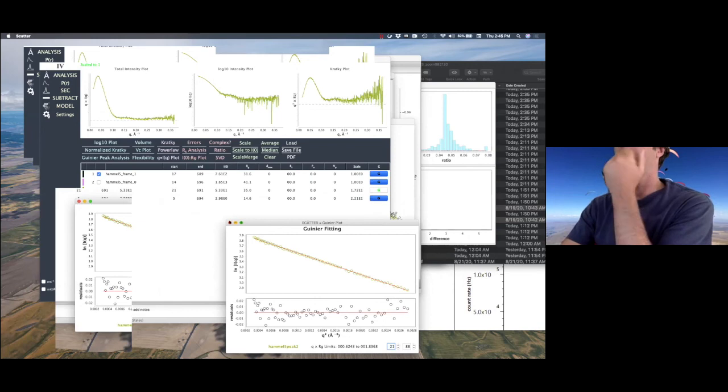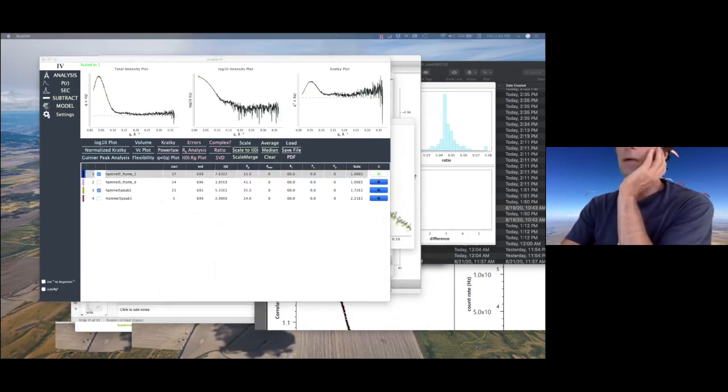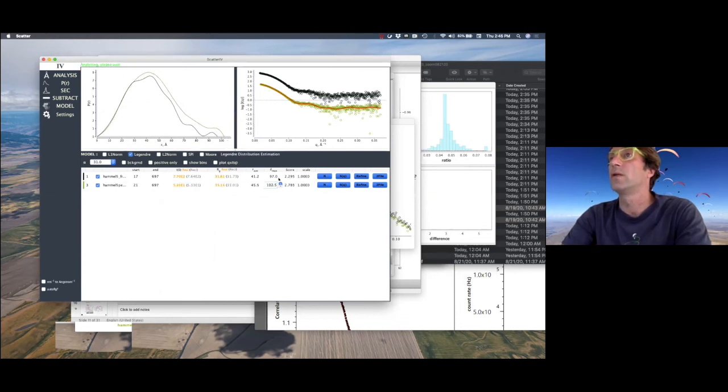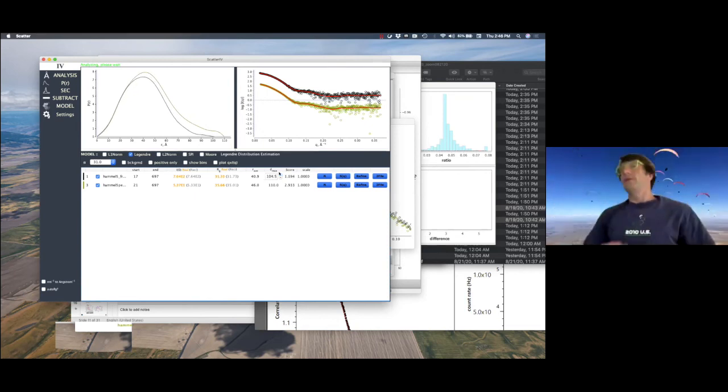Okay, that's the radius of gyration without and after SVD. So 31.7 within 35, and obviously the P(r) functions are significantly different with and without deconvolution. Okay, so this is it.